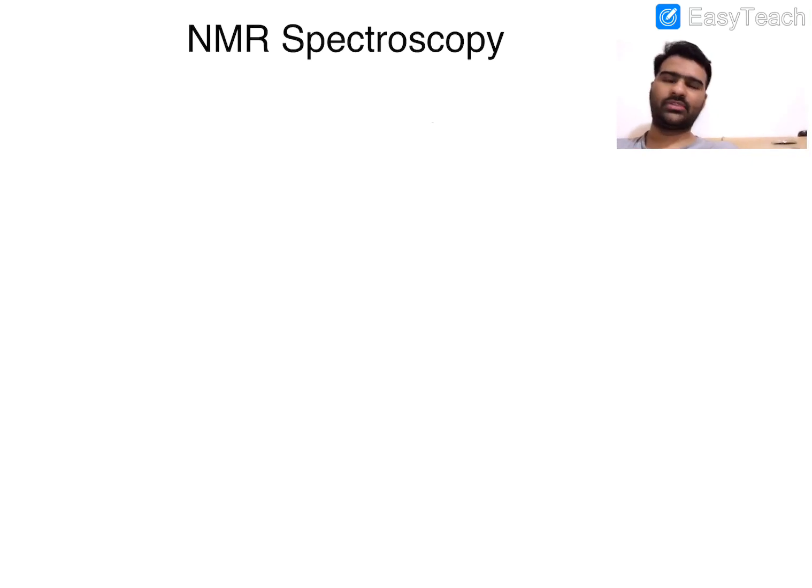Welcome to this second lecture in the series on NMR spectroscopy. What we've done in lecture number 1 is that we've looked at some basic terms and recapitulated all of them with respect to NMR. We'll be continuing that to different types of NMR spectrometers and also concepts which are very important and crucial to understanding an NMR spectrum, which is chemical shift.